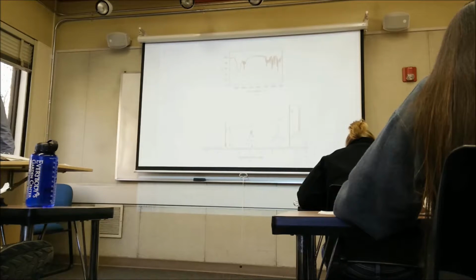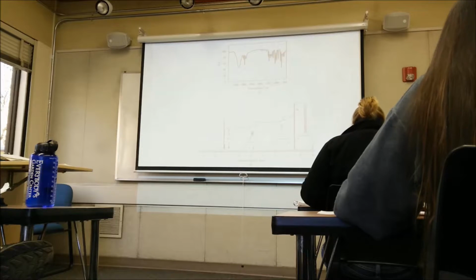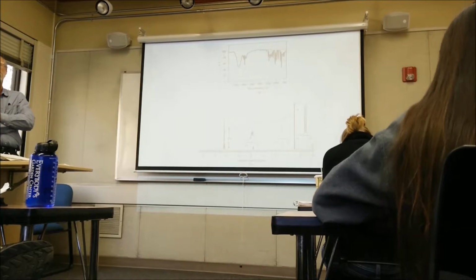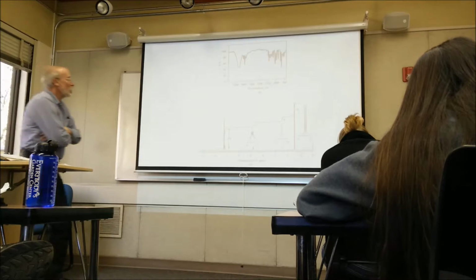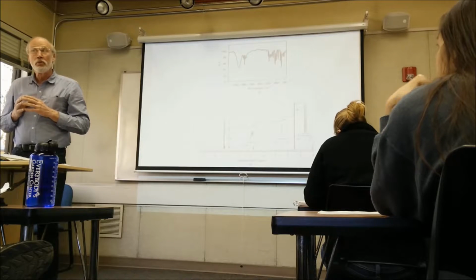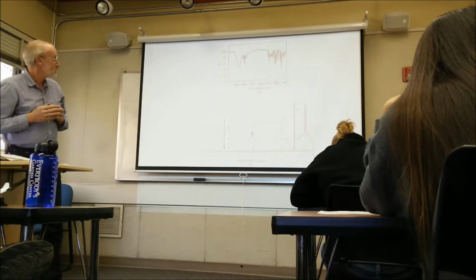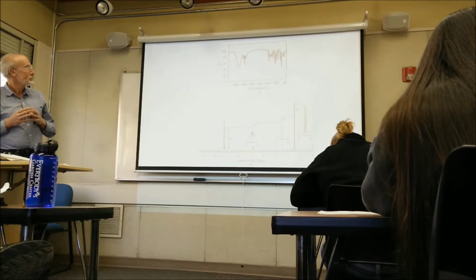Hey, we have IR. Yeah. Okay, and you also have a molecular formula, C8H10O. Okay, so we have the OH. Okay, you got the alcohol. Can we assume that it's just a benzene ring, or do I have to try and figure it out? I would start with a benzene ring. Anytime you've got 4 or more degrees of unsaturation, start with a benzene ring. I cannot tell based on the IR. It's right around 700. There's a big peak.